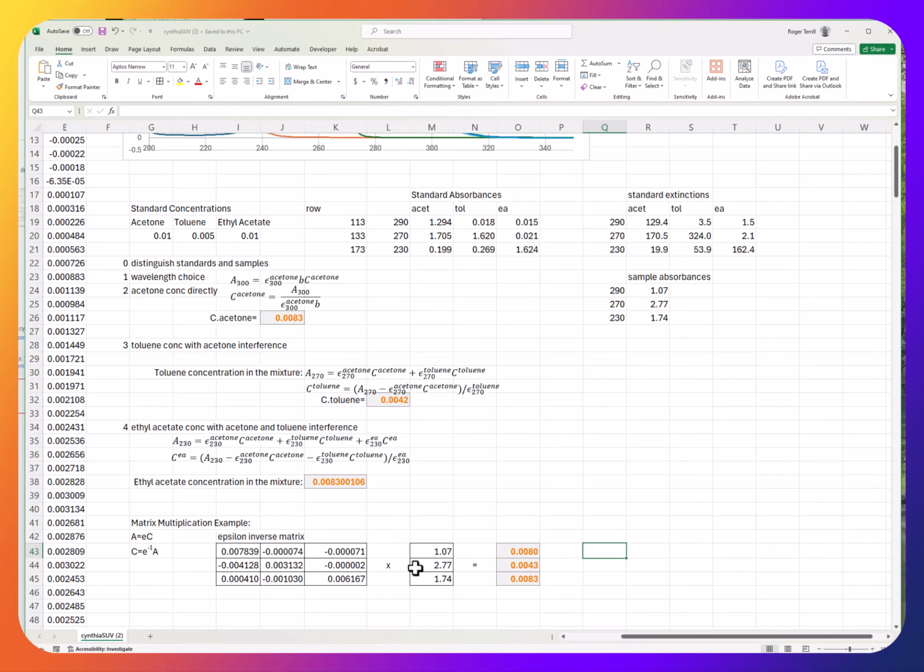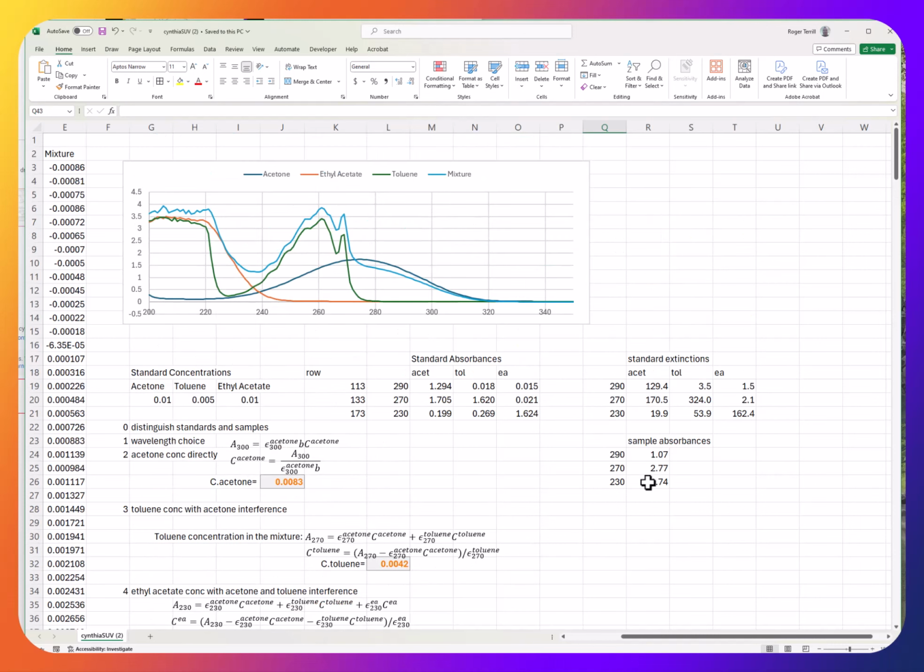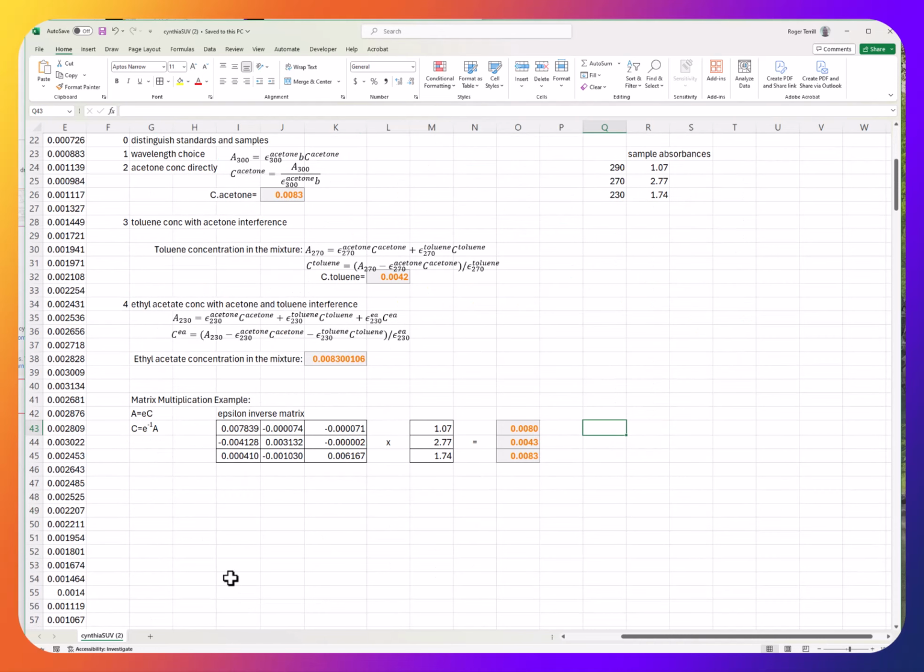So this is cool, but I tell you what's even cooler: to find what concentration set makes this blue the sum of a coefficient times the black, the dark blue, and the red. And that is called Linest.